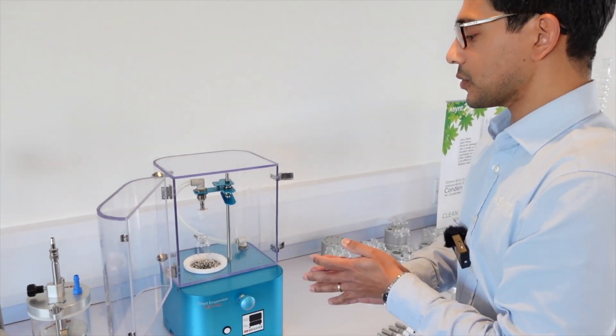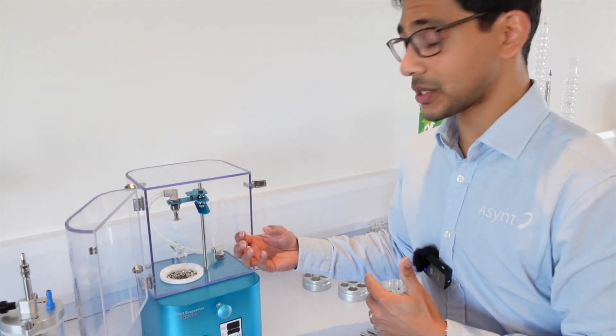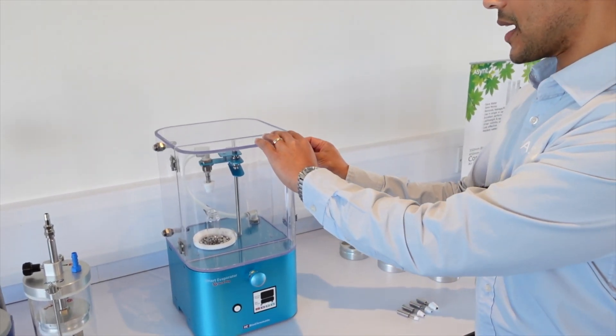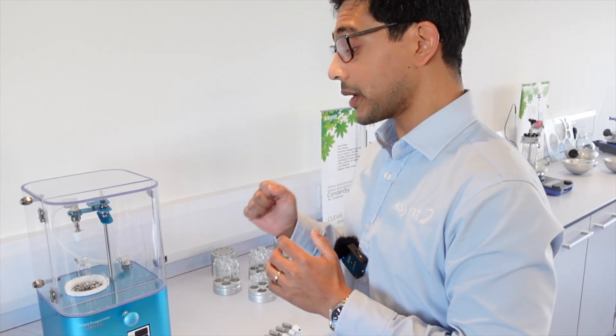This bath can heat your sample. When you connect a vacuum pump to the back, or house vacuum, you get very quick evaporation of your sample and it can even take off very high boiling solvents. That's perfect if you use a variety of different tubes and vials and you just want to run one at once.